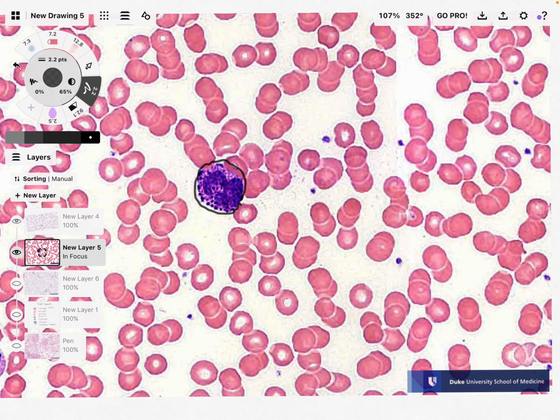So what about an eosinophil? Remember, it's in the name. Eosinophils are eosinophilic. They get that term because they love the eosin stain component of the H&E stain. And eosin stains components of cells a reddish color. Reddish, pinkish, maybe sometimes orange. And indeed, I do see some pink, reddish hue within the cytoplasm of this cell. So that could be an eosinophil.